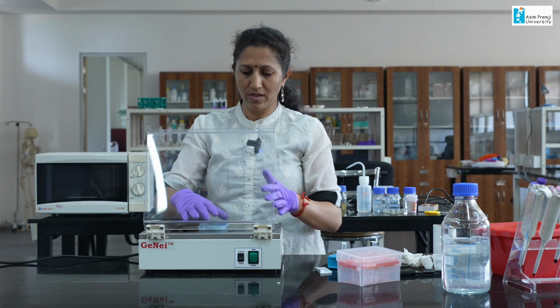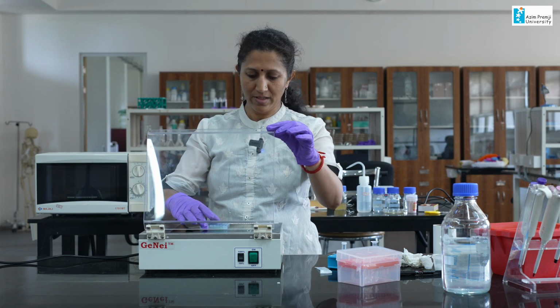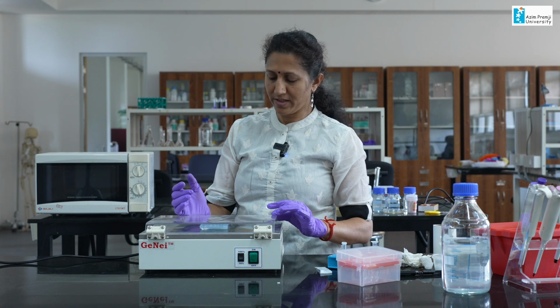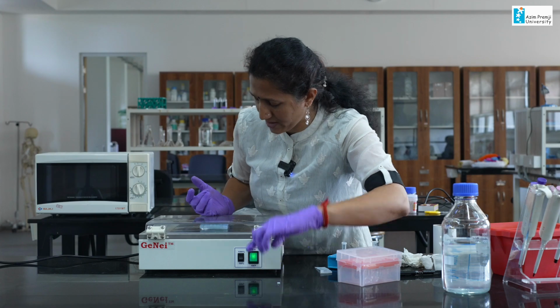Okay, so my gel is ready now. We have run the gel till 3/4 and I have taken it and placed it on a UV illuminator. You can see now what happens when I turn on the UV light.